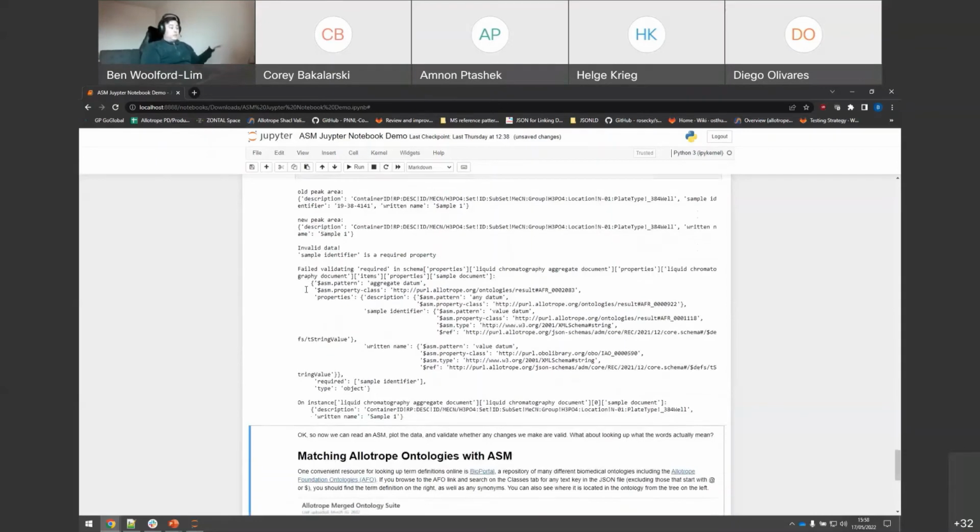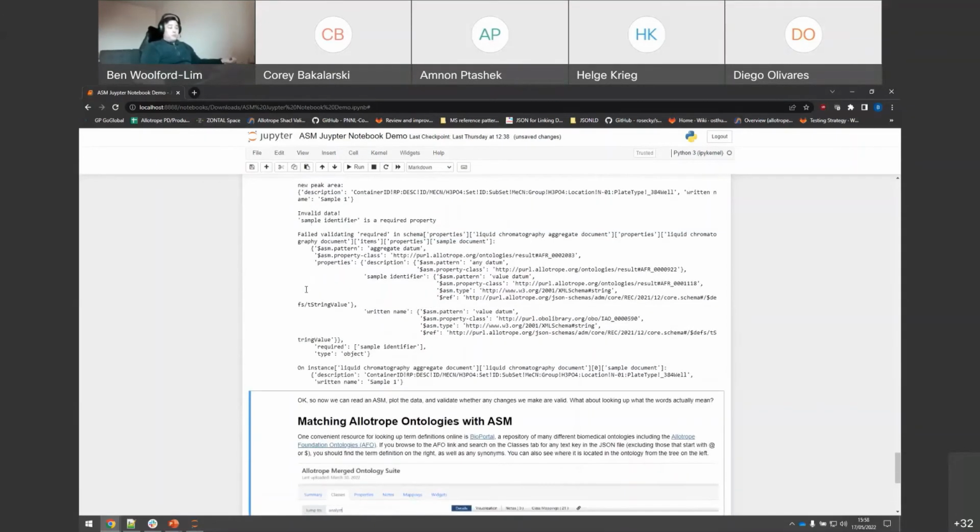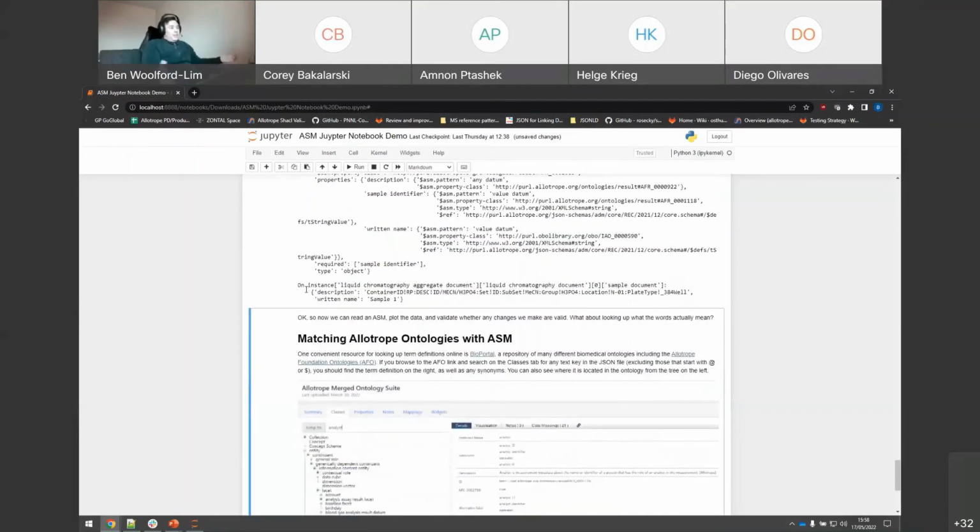In this, we've just pulled down a file, we've read the data, plotted the chromatogram, the peak table, we've tested the validation and made sure that it fails, works when it works and fails when it fails. All in that 10 minutes. Easy. I can say it, but hopefully those who do data science or use Python are nodding and agreeing. Maybe those who don't might look at it slightly more askance. But it really isn't as complicated as you may fear. It really is that easy.